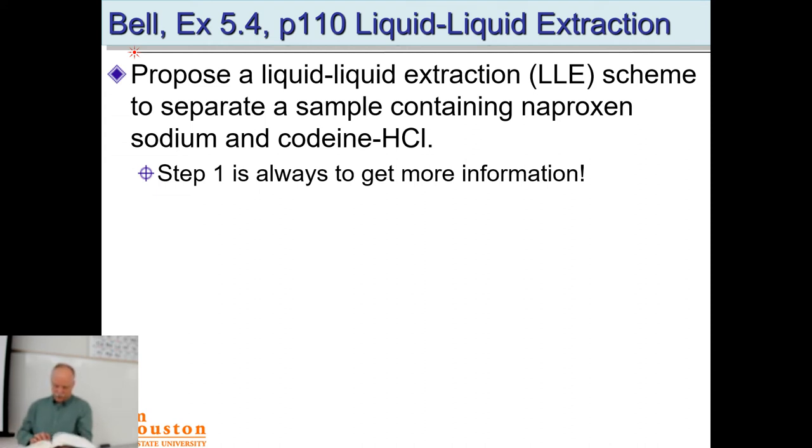It's got LD50 information here, so the toxicological information. That's the lethal dose where 50% of the population is expected to die. Because mice are mammals, that's somewhat of a mimic for us, so we could say it's about the same or similar toxicity in humans. It's not that toxic, actually.